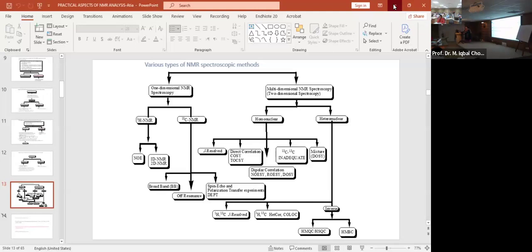Concentration has some effect on sensitivity, definitely, but there is a limit, because the solubility in 0.5 ml is a small quantity. If you have 10 milligrams of sample, then maybe 4 scans are required instead of 128 scans. A scan is each repetition of the experiment, so it overlaps with each other. We'll discuss it further.